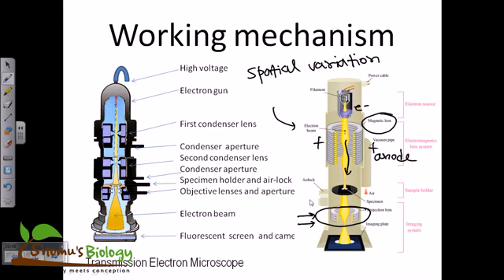So that's why we generally don't use the transmission electron microscope more often in the context of life science or biological applications. But it is important, and we can use it to look at the ultra thin structures of the cell, like the cilia structure, how the proteins are moving inside the cell, and all these things. But the whole system of the transmission electron microscope as well as the scanning electron microscope is limited.